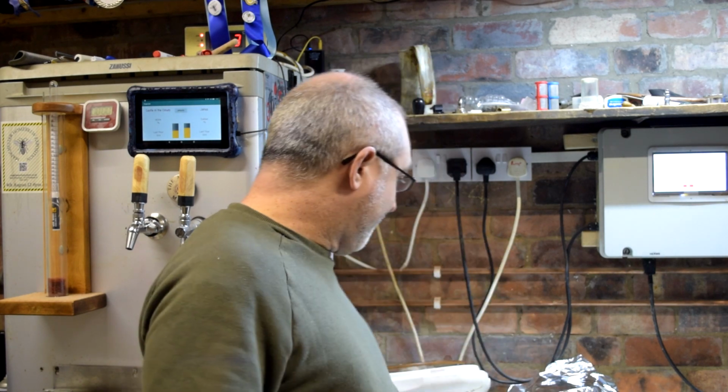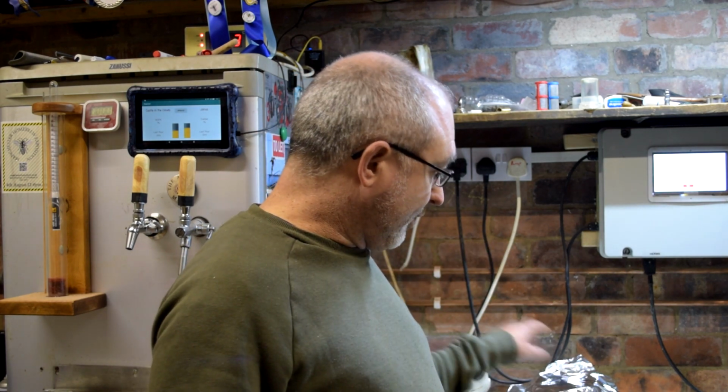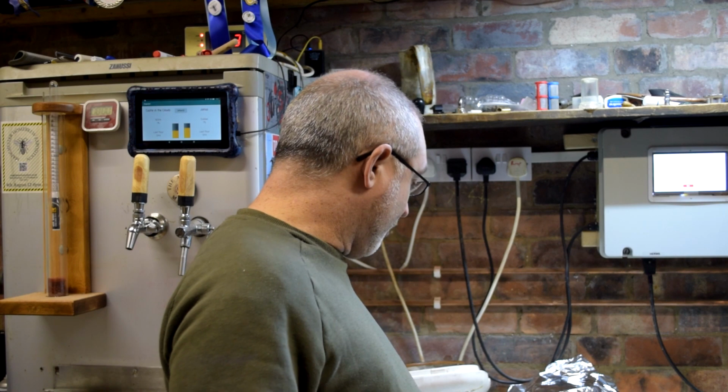Okay, so after all the maths is done, that worked out at about 4.5 to 5 million cells per millilitre in the wort, which feels a bit low. 6 million would be normal for beer, maybe half that again for lager, but I suspect the problem here is my technique and counting. I expect my measurements are off, I've got the wrong amount somewhere, or I've got something wrong with the hemocytometer, which I bought a long time ago and probably don't have the accurate details for.